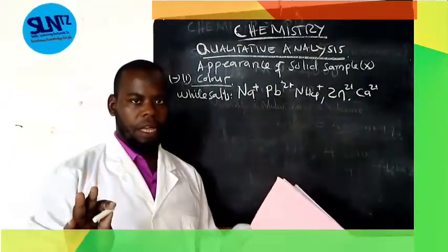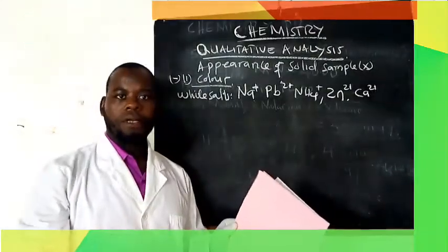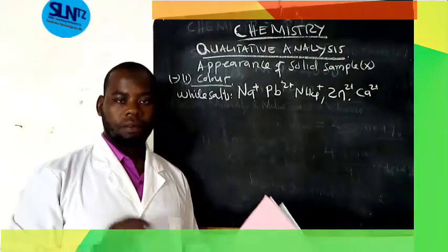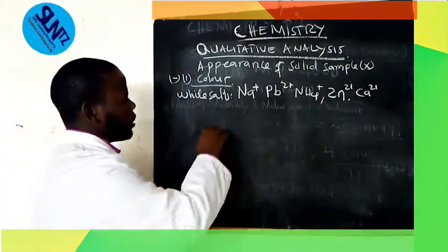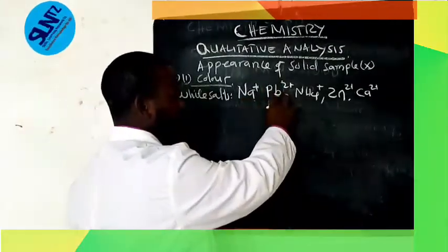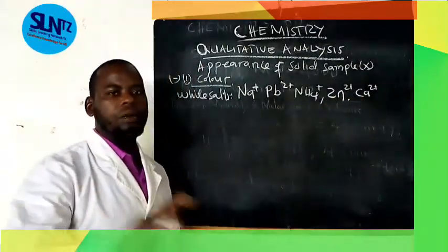And my fellow students, I will talk about it at a lower level, but you can use it in advanced level. Are we together? So my expectation when I see a white salt is to get sodium, zinc, lead, ammonium, and calcium, and not otherwise.